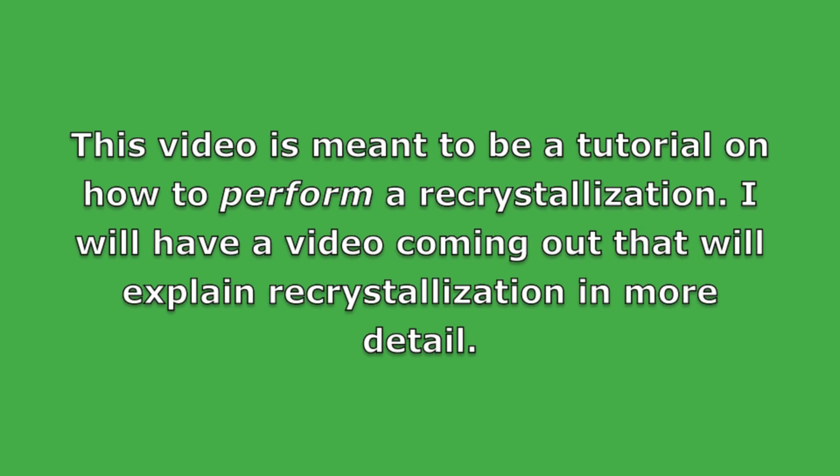In the interest of keeping this video short, I am not going to describe in detail how recrystallization works. However, I will have a separate video on this in the future to fully explain what recrystallization is and how it works. But essentially, recrystallization is just a technique that is used to purify solids.